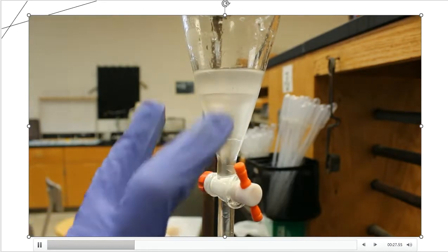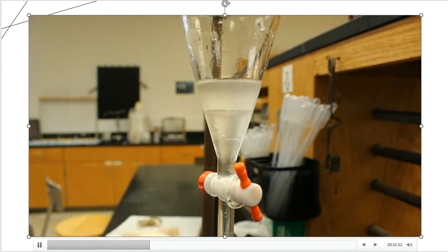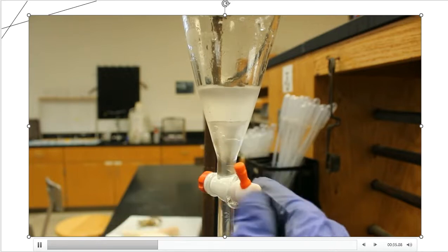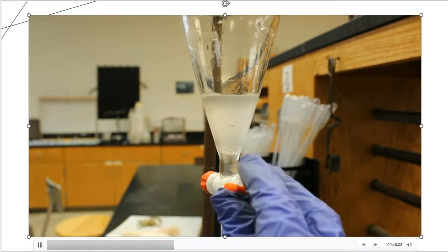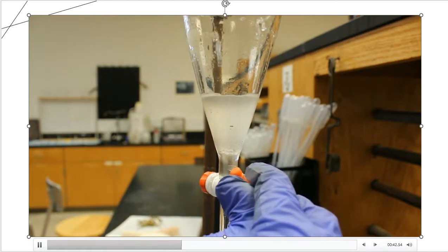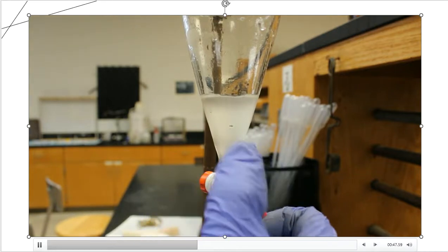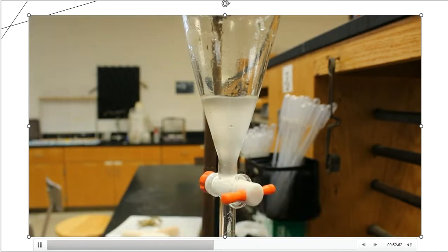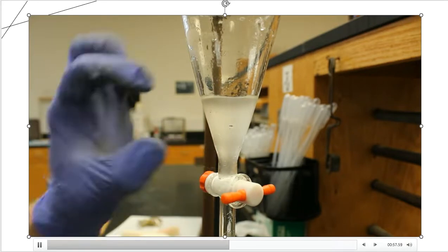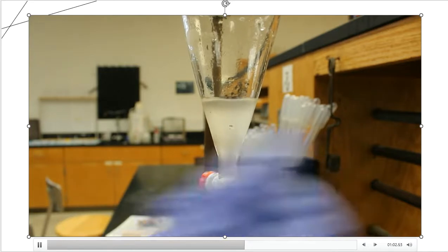Notice that this is tapered. The reason that it's tapered is because the closer that it gets toward this end, the better the separation is going to be. So you're going to see me slow it down at a certain point, and then I'm just going to continue to let it drip into the container down below until it actually gets to the stopcock hole. And then at that point, I'm going to stop it, and then I'm going to remove this bottom layer.